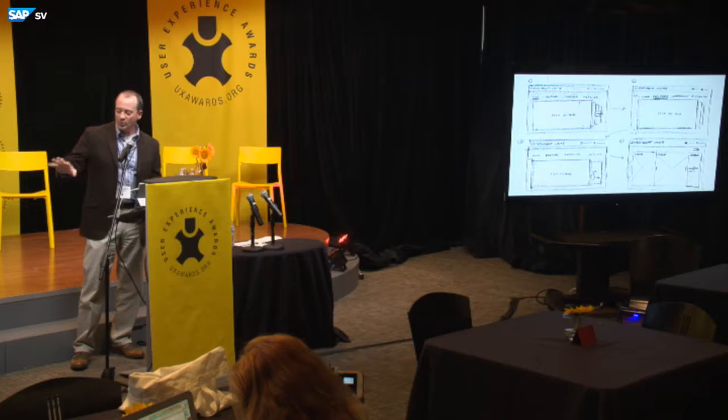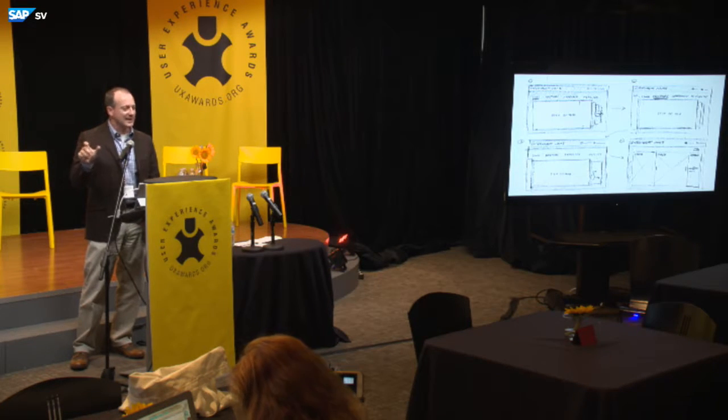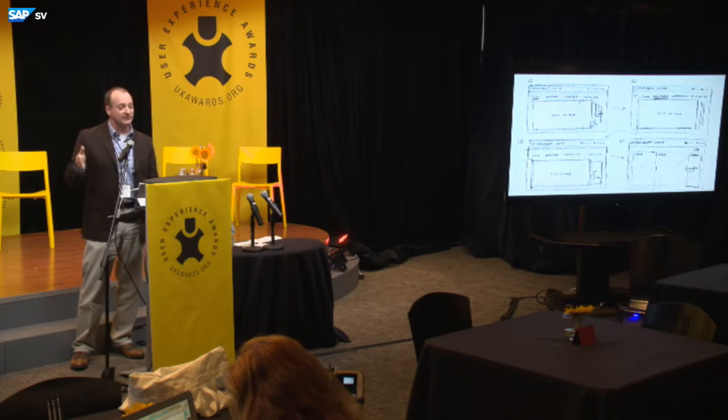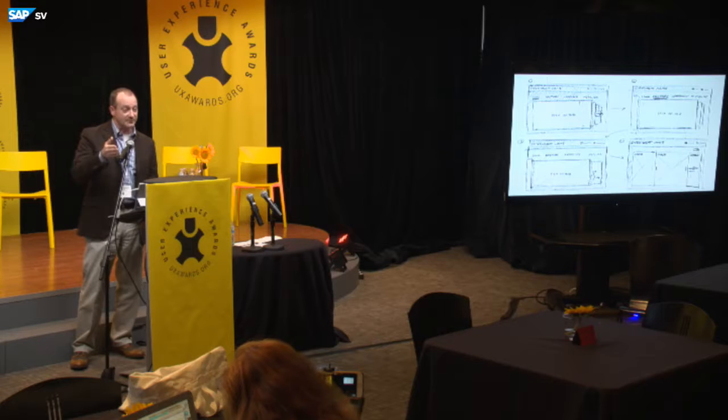The first thing we did was we embedded some training in the layout of the global navigation itself. You'll notice across the top here, load, prepare, approach, measure. Those are the 4 main steps to taking a good picture of something really small. And you start from the left and you work to the right.